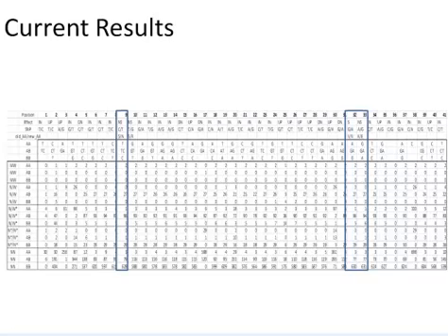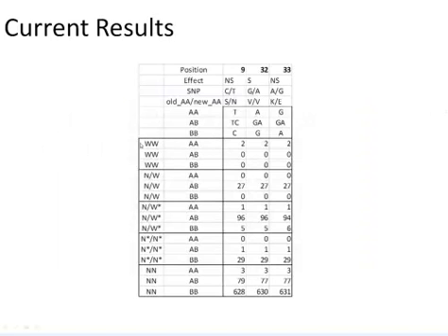But then we actually went back and looked at the actual genotypes. I know it's a little busy, but we pulled out that there are 3 SNPs that look promising. So we're looking at the 2 animals that are Weaver affected, WW, animals that are Weaver carriers from progeny testing, animals that are identified as Weaver carriers from the genetic test, non-carriers from genetic testing, and then a non-carrier just because they hadn't been tested. Everything looked great. These 3 SNPs are homozygous for one allele in the affecteds. They're pretty much heterozygous in all the carriers, and they're pretty much homozygous for the other allele in the non-carriers.